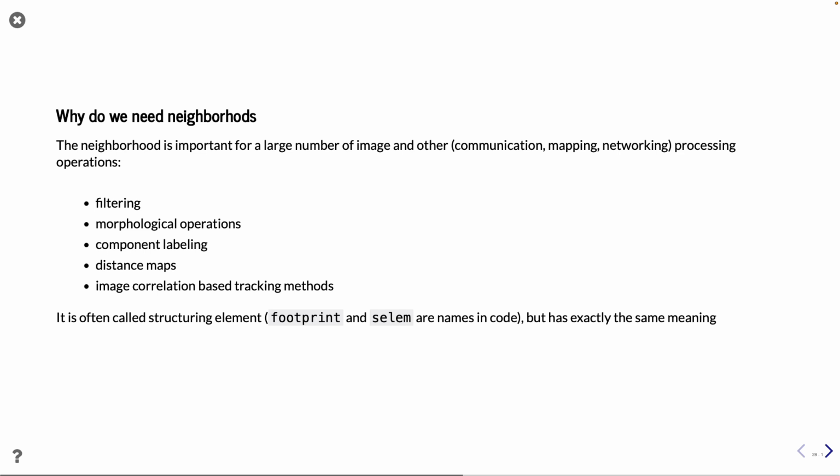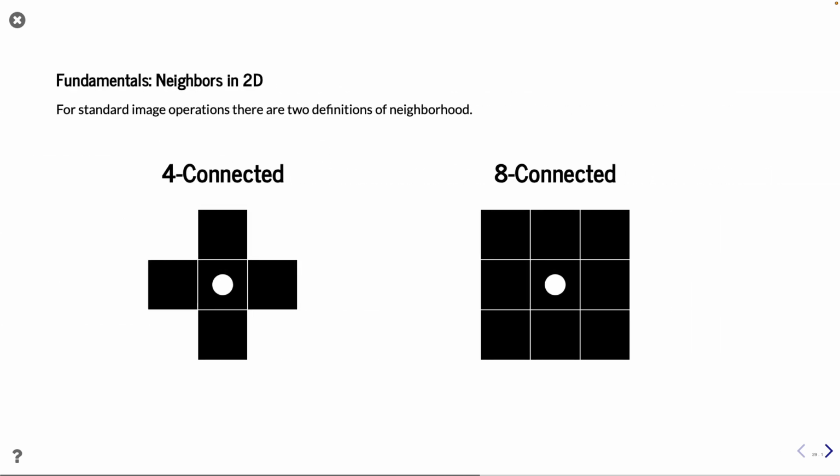Well, that one we can skip. It's just a general thing about the neighborhood. When you start looking at the neighbors, the first principal ones are the 4 connected neighborhood, which only looks up and down and sideways in the neighborhood. And then we have the 8 connected, which looks actually at all the pixels that surround the current one. Which one you choose depends on what you need to remove and also how gentle you have to be.